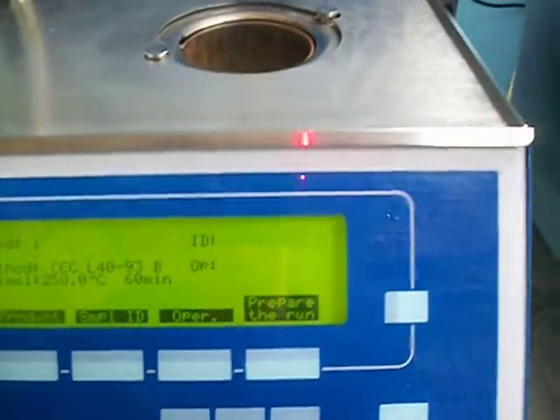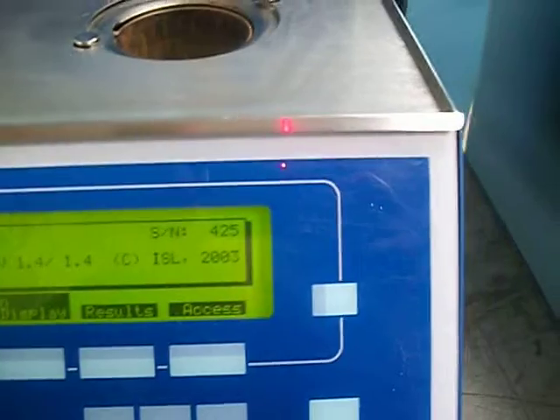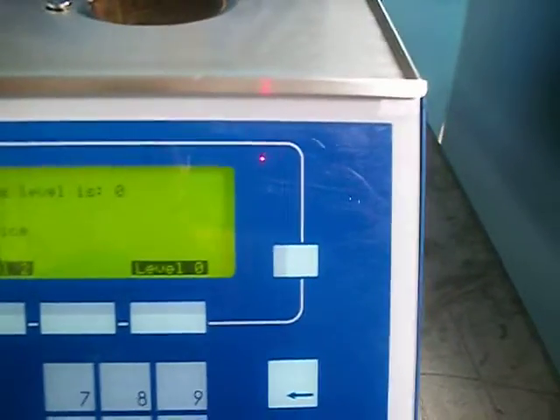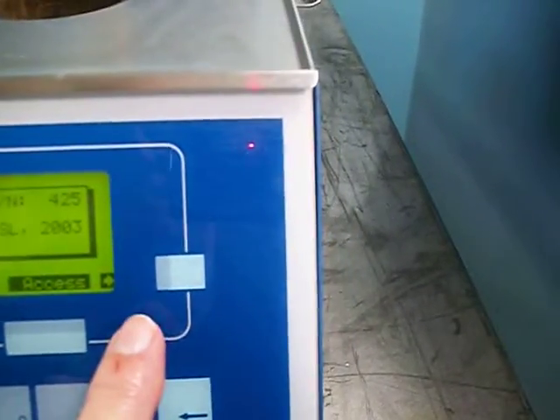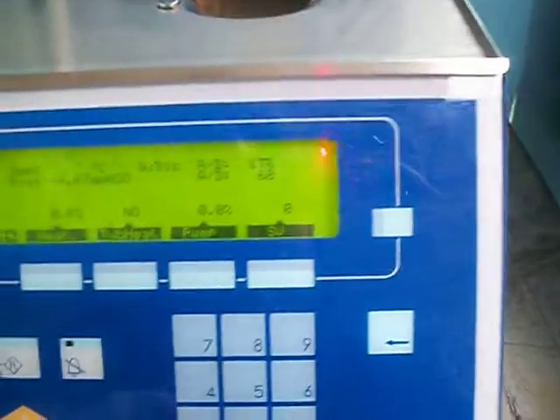I'm going to push English. I'm not going to compare around — let's go to access level 2, and let's try service diagnostics.